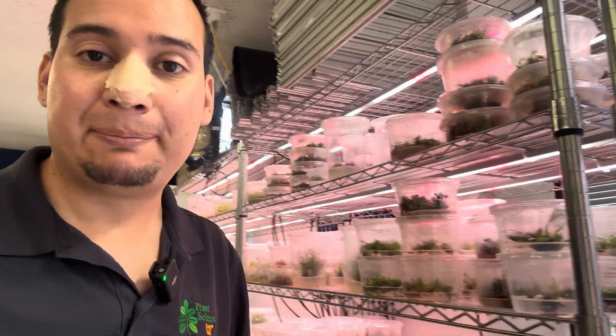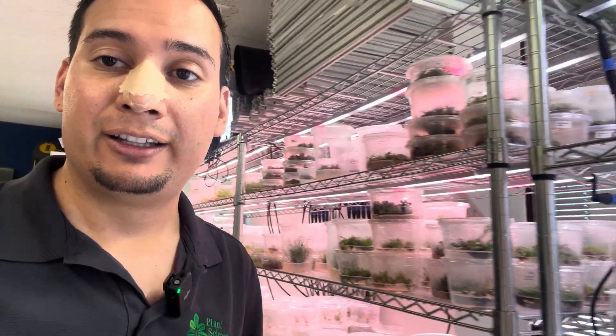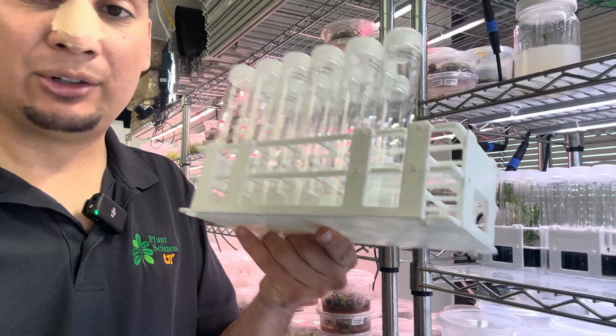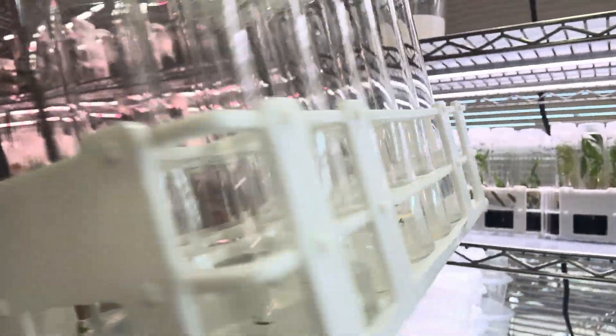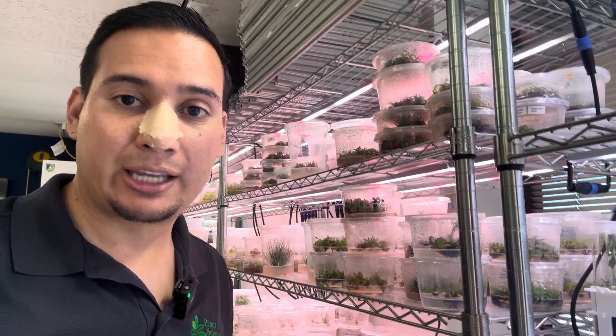One experiment that people have been asking me for updates on quite frequently is the nepenthes. I have Nepenthes edwardsiana seeds that I sowed — seeds I got from Jeff from Nepenthes Gut. Thanks so much to him for providing the seeds. Here are some of the results. They're still sprouting, as nepenthes are notorious for taking a while to sprout. We do have some plants that have sprouted — you can see the tiny little plants. If you haven't seen the video, make sure to check it out. I sterilized these seeds using four different methods and they have given me good results.